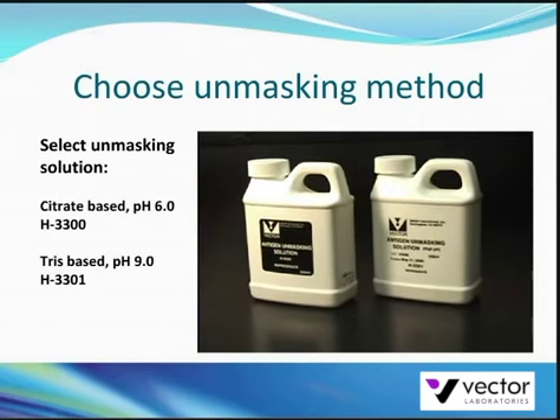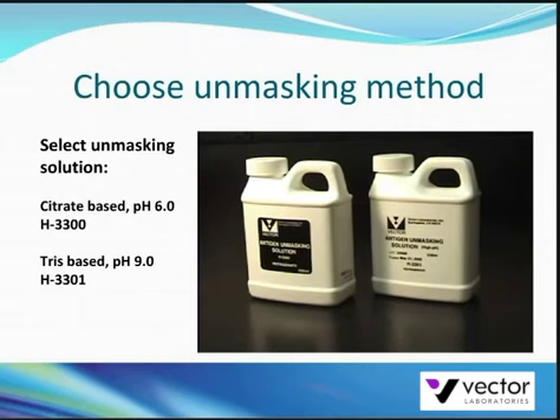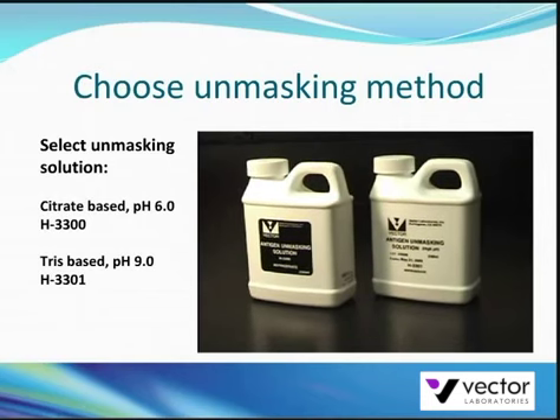Both solutions can be used in high temperature antigen retrieval protocols. Here we will demonstrate a reliable and economical technique using a pressure cooker.